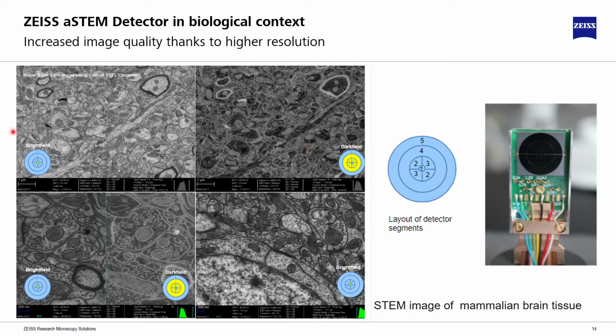For example, with the center activated, you have bright field, which is very typical, but probably more TEM imaging is the dark field. We are activating here the outer areas of the detector, and we can mix between them or have different conditions according to how the electrons are scattered and collected by the detector when you activate, deactivate, or invert the polarization of these areas of the detector.